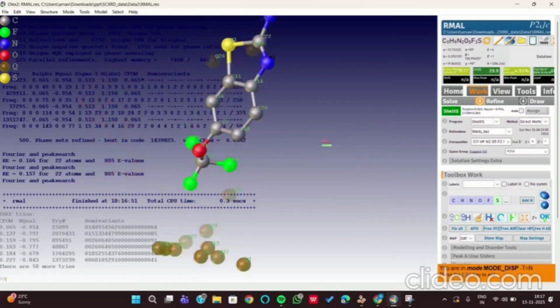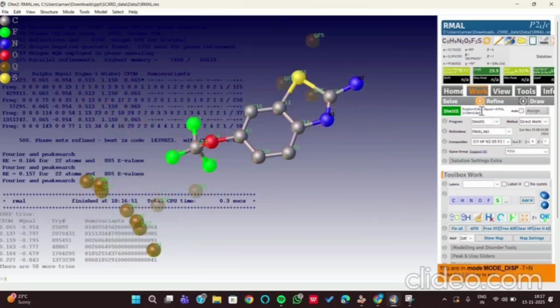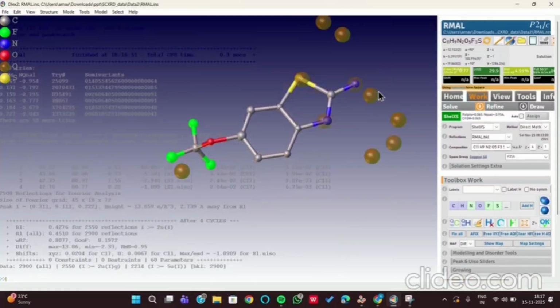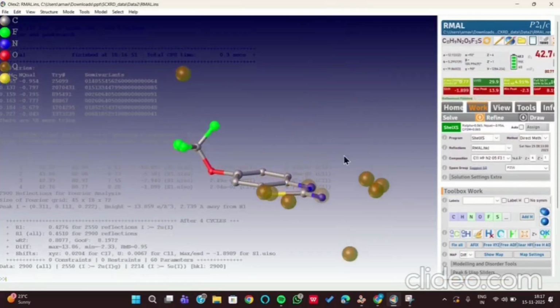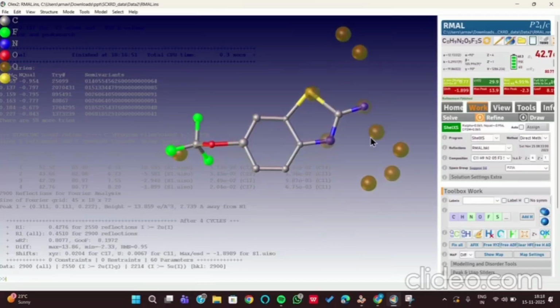So this is the structure we got by our initial guess, so we'll just define this structure. Now we can see this is the structure we got after refining it. If there is a malonic acid, it will be similar to this. We are not getting it, but we can simply by guess assign this carbon with 2 oxygen. Then again we'll refine it to get the better structure.